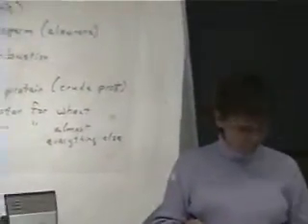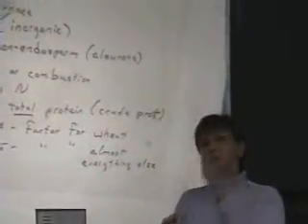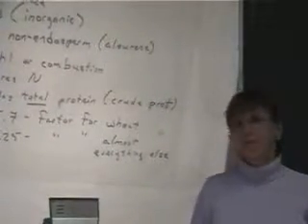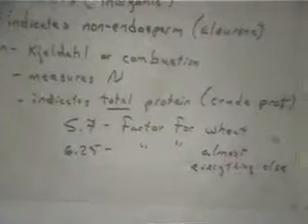You just listed Kjeldahl and combustion. Why is the NIR listed separately? It's not a standard method. The NIR is not a reference method. So you run NIR, but you have to base it on one of those, on a standard. And when you multiply those, what does it give you? It gives you percent. When you multiply the nitrogen times the correct factor, it gives you the percent protein.